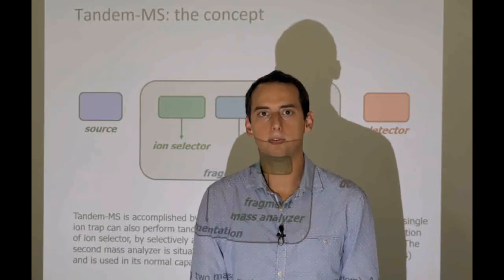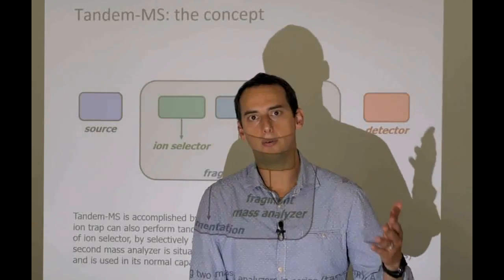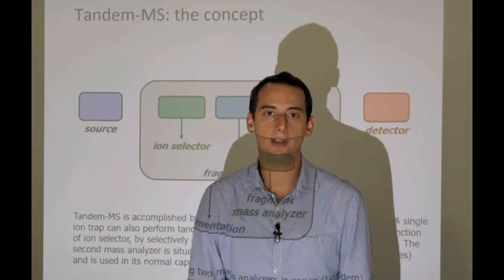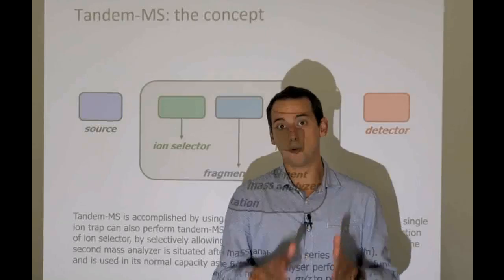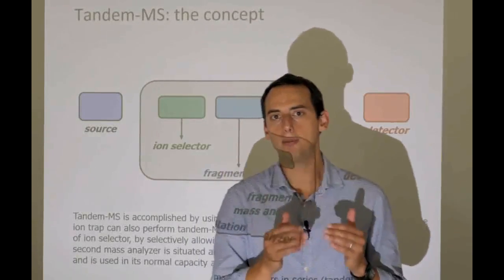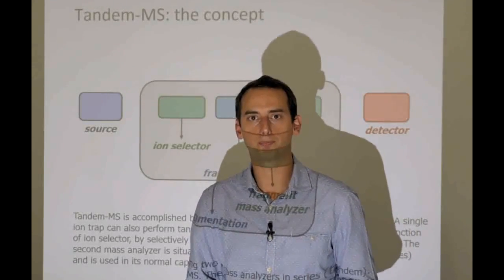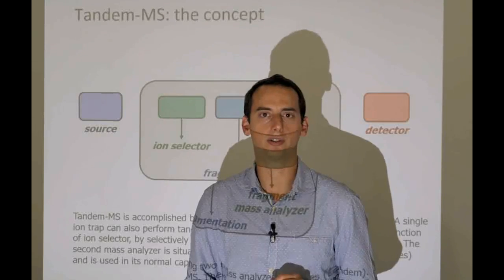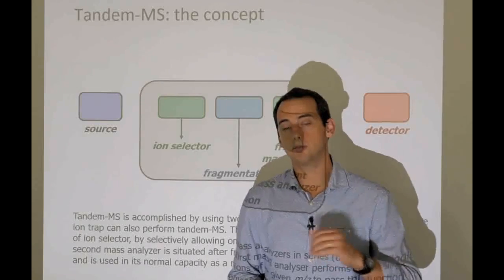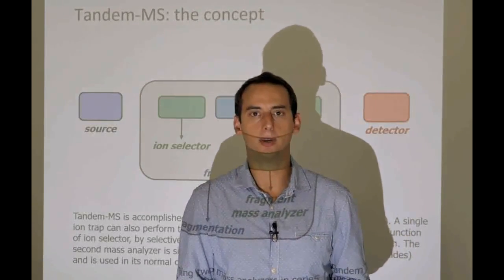But you can liken it to a room full of people, say a room full of students, and you measure the weight of each of these students. The question is, will we have sufficient information, just knowing the weight plus minus a certain error of the scales that we use, to uniquely identify every student in, say, a 60-student classroom? And that is actually going to be very difficult. It's difficult because many people could have the same body weight, and in fact, this is likely to happen.